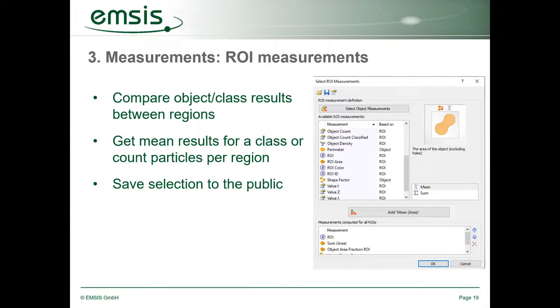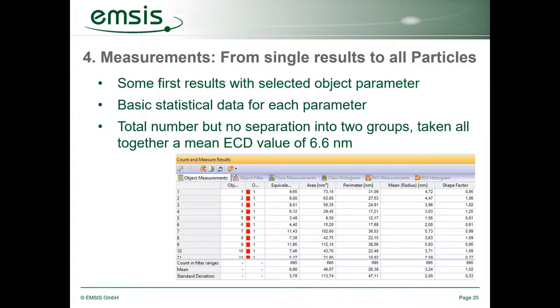And the same here, all configurations can be saved so that you just need to do this configuration once, and later on you can just load it. All right, so this was all kind of preparation we need to do at the very first time. Later on, we can just make use of it.